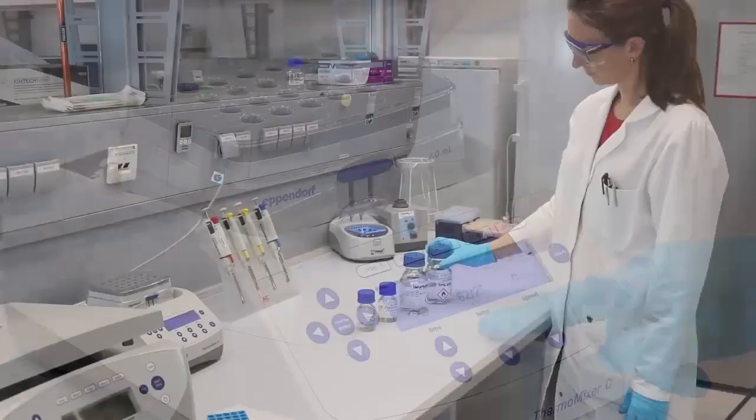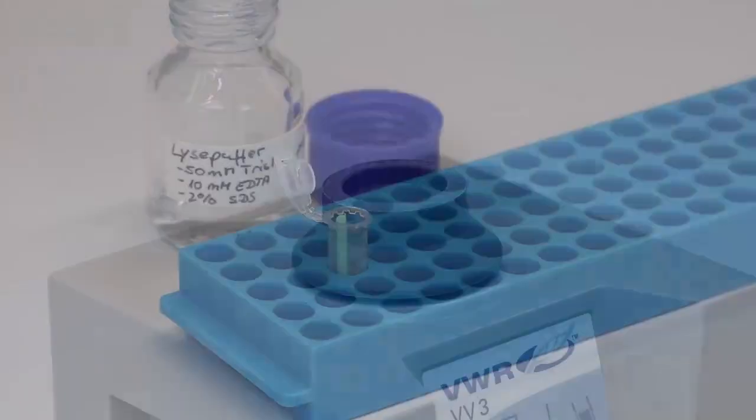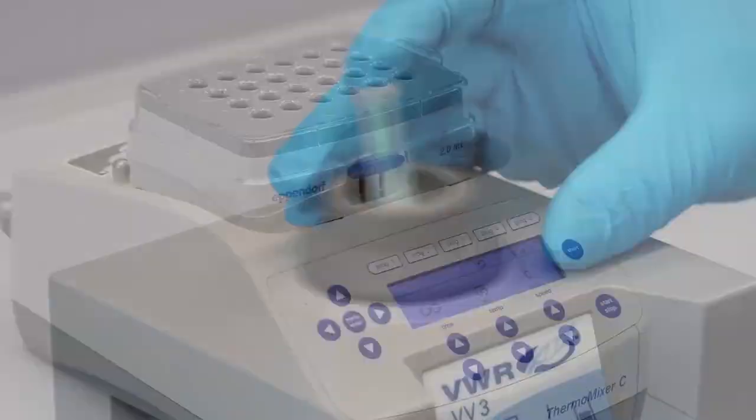Add 500 microliters of lysis solution to the swab, making sure that the sample is completely immersed in the lysis solution and vortex the sample for at least 5 seconds.